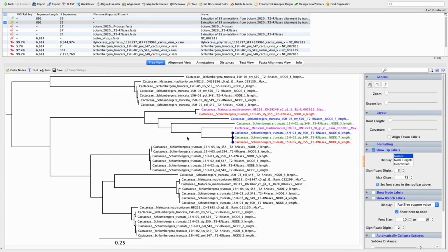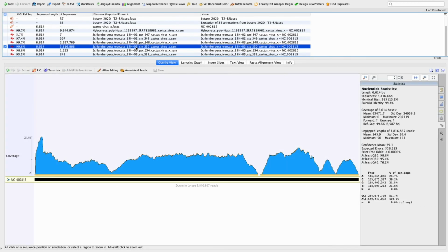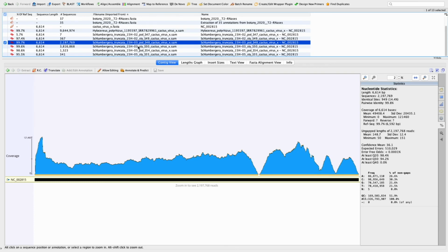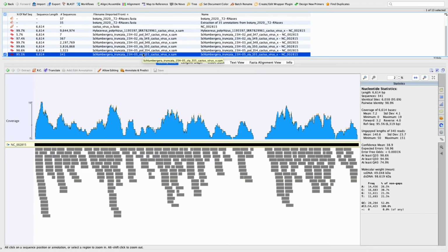You may recall that I asked Kakapo to map reads to the cactus virus X genome, but I did not elaborate further. We noticed that some of our individuals were not looking so great, and perhaps unsurprisingly, we discovered many cactus virus X reads in those samples. Both styles and pollen of this individual, for example, contain millions of cactus virus X reads. Other individuals apparently are also infected, but the load is multiple orders of magnitude lower.